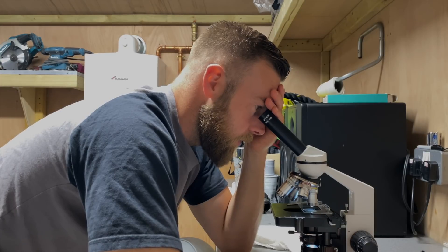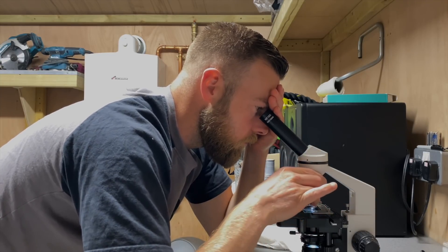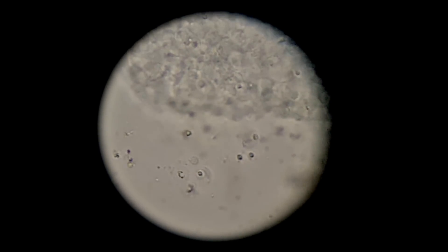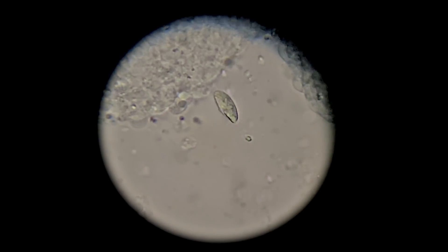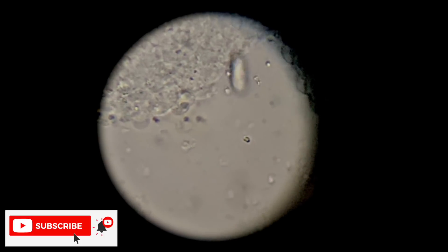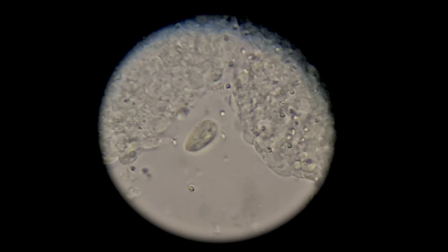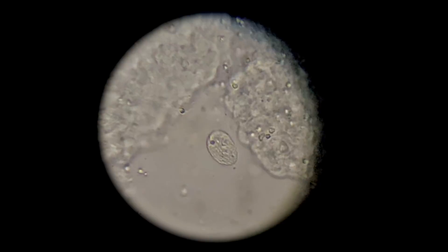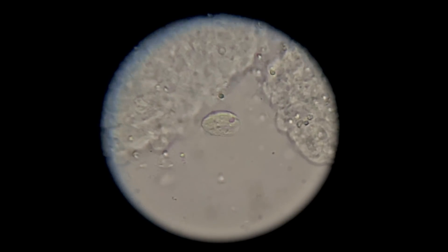But I had to get her out. Chilodonella. That is a bittersweet moment — bitter because I've found something, and sweet because I've actually found something. That just goes to show how important it is to do multiple scrapes. I've actually taken seven scrapes: each side around the gill openings, around the ball joints of the pecs, towards the tail, and then underneath as well. So that's seven separate scrapes — if I'd have only done a couple, I would probably have missed that.